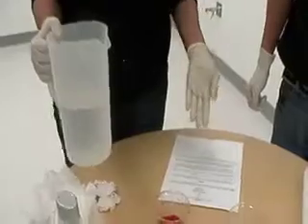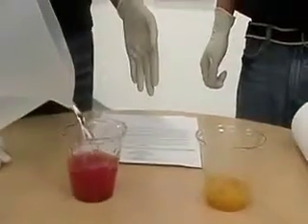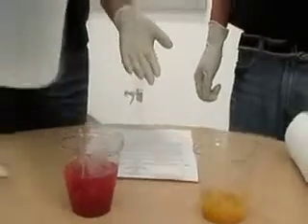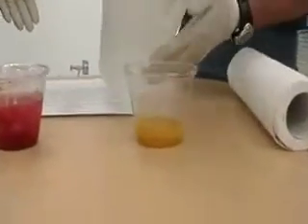Okay, so now that the fruit is all smushed up, the next step is to add an equal part of water, and it really doesn't have to be exact. So I'm just gonna eyeball what I think is equal. That looks good to me. So Ron, go ahead and do the same with his peaches.